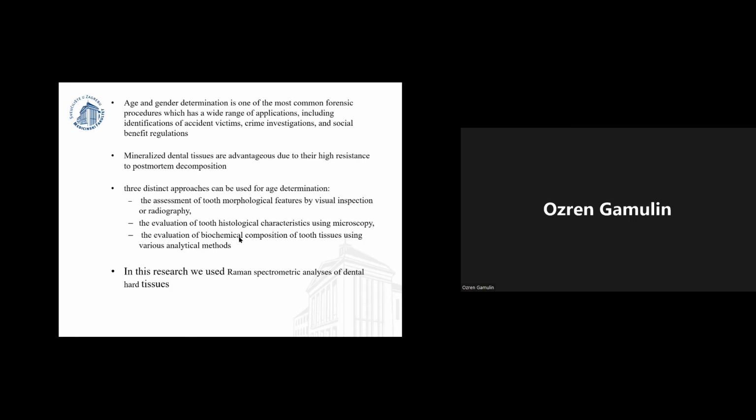In this case, we are using this third approach, and we are using Raman spectroscopy for determination of the age. We will divide this presentation into sections. One section is about age determination, and the other is about gender determination.